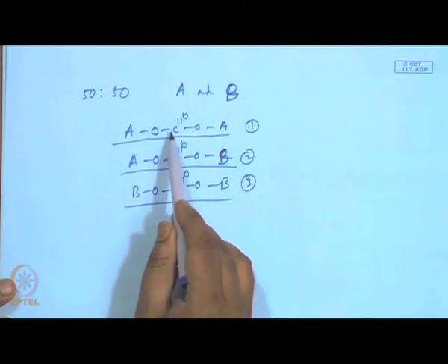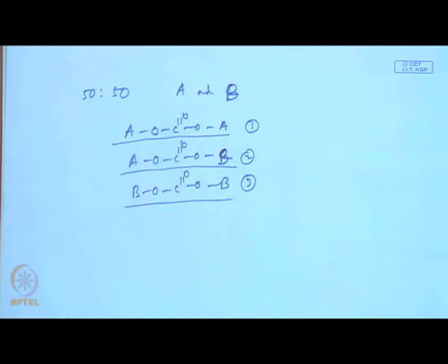Now, from the ratio of the intensity of these three, as in this NMR spectrum, we can find out the ratio of this particular type of carbonate present in the copolymer.